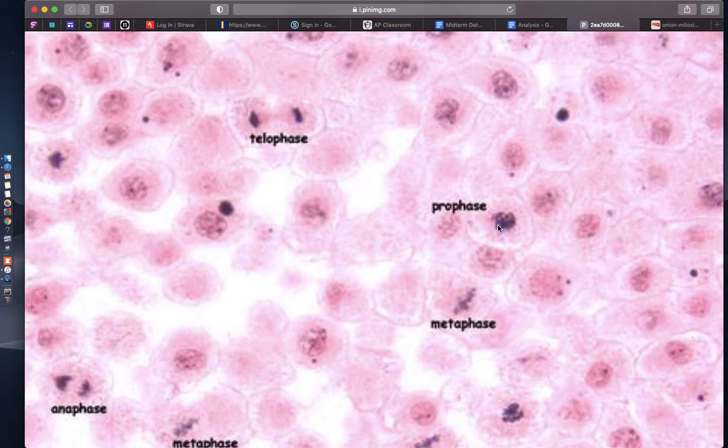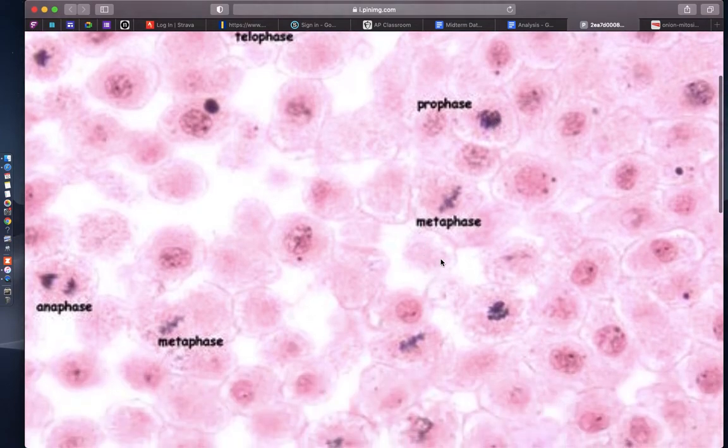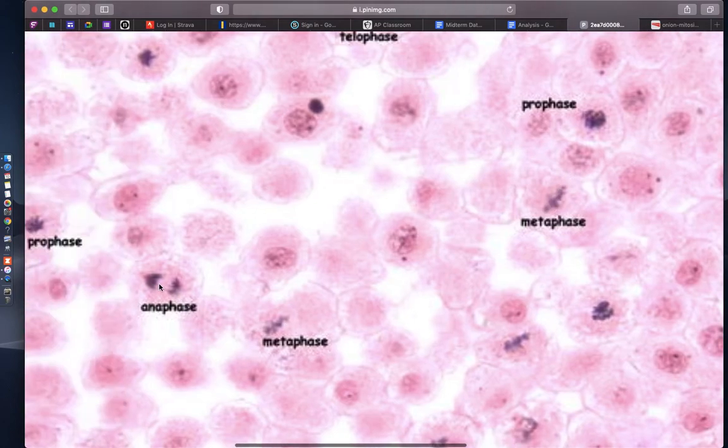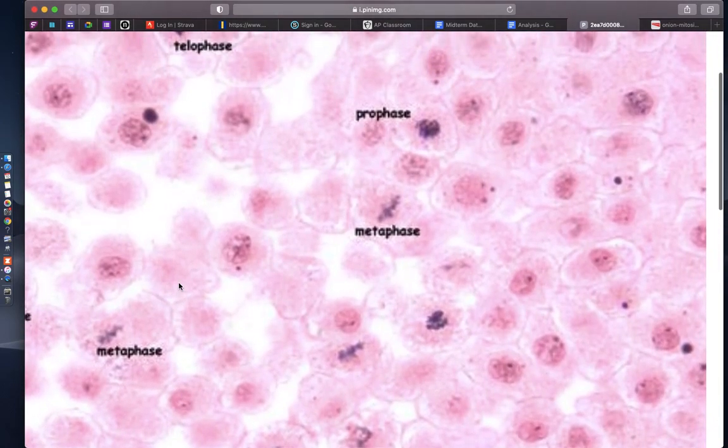are forming. Prophase is going to be when we see that condensed chromosomes, not yet in individual sister chromatids yet, but it's very visible. This is a very faint metaphase, but we can see all of those chromosomes lined up. Another example right there. Here's anaphase. Anaphase sort of looks like two clusters of bananas being separated apart. So some good examples of that.